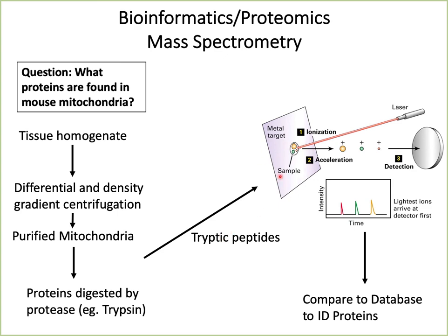And then you absorb those samples onto the specimen holder and shine the laser beam on top of that, and all these small peptides that you have produced will pick up the charge and accelerate towards the detector, and the smaller ones will go faster compared to the larger particles. Each time the time of flight is detected, you will get a signal. So you compare these flights, and then you can tell the molecular mass. Now the computational process is extremely robust. For each of these, you can find the mass of a peptide.